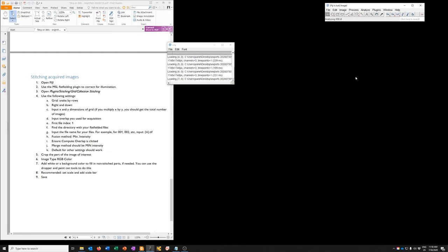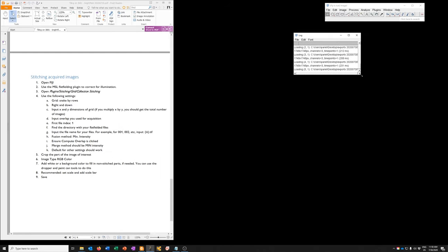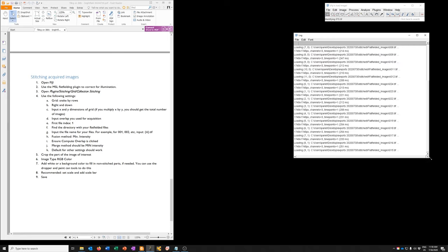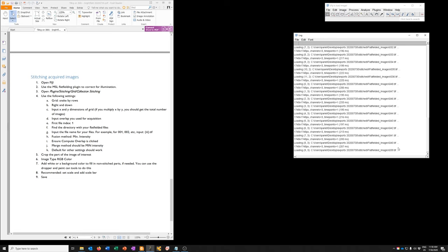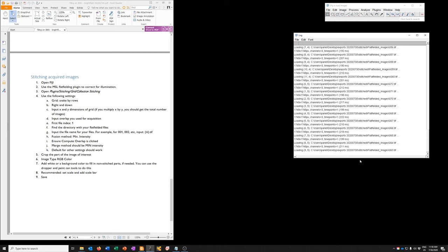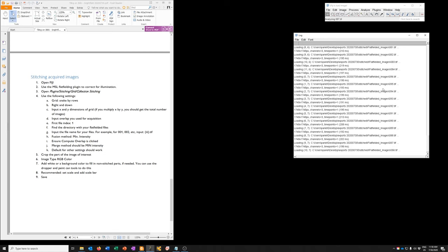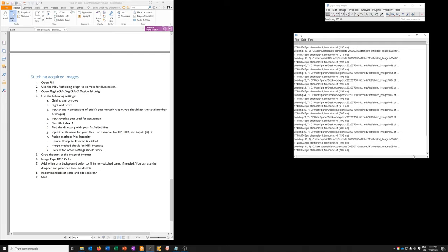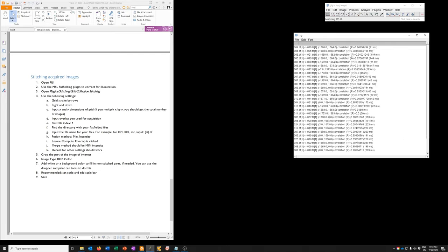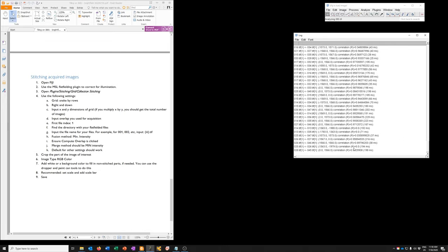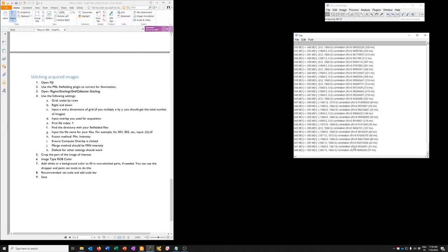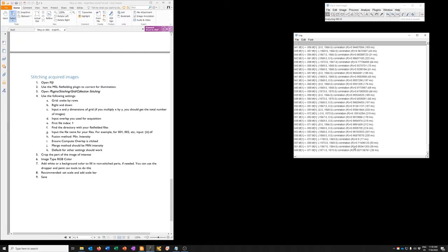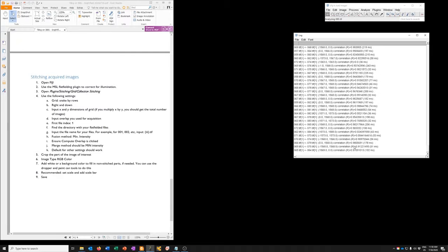What you'll see is that the log will show a lot of information about how it's aligning all the images relative to each other. And eventually it'll scroll down really quickly with a bunch of parameters that you really don't need to pay that much attention to. You can see there's 96 and it's doing all pairs of alignments. And then you see all these correlations.